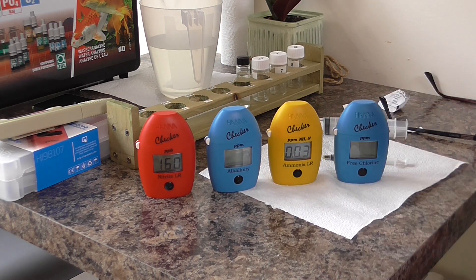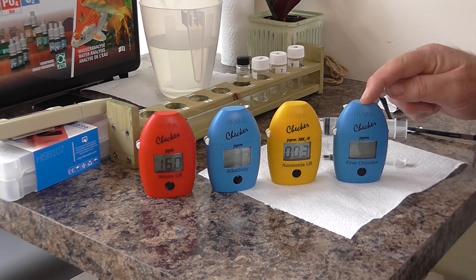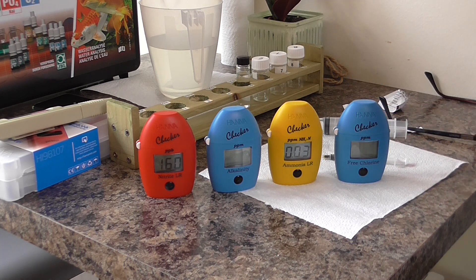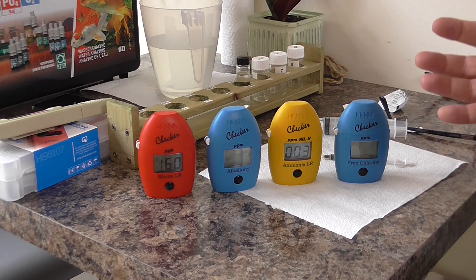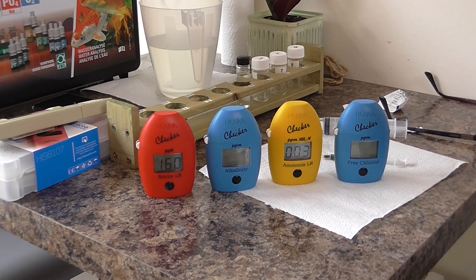So that's the four test kits — nitrite, KH/alkalinity, ammonia, and chlorine. It's so much easier when you actually get a physical number to work with rather than a colour you've got to try and match. These kits each cost around £70, and you have to buy reagents separately — 25 per pack at around £20, so roughly £1 per test. It's not cheap, but you are getting numerical results which are much easier to understand.